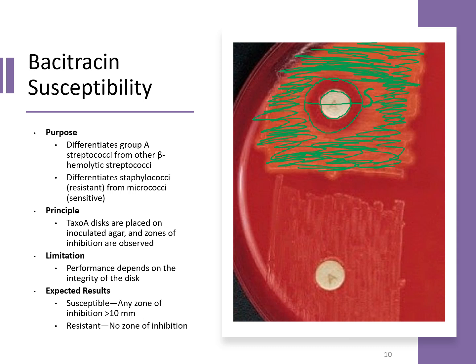If, however, it is resistant, then there is no zone of inhibition, and that organism will grow all the way up to that disc.